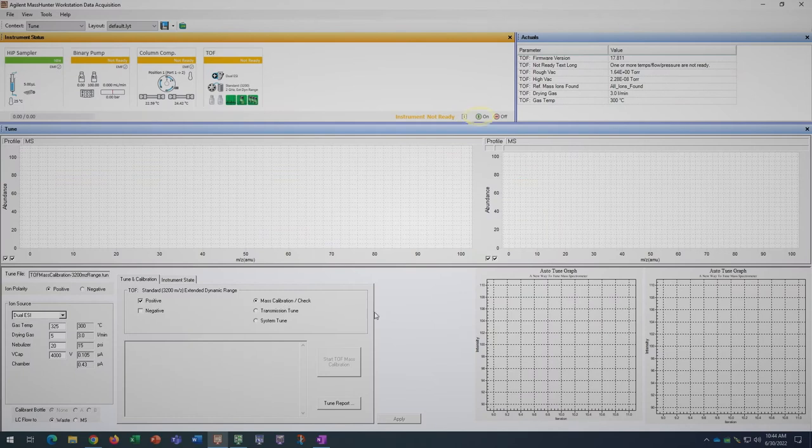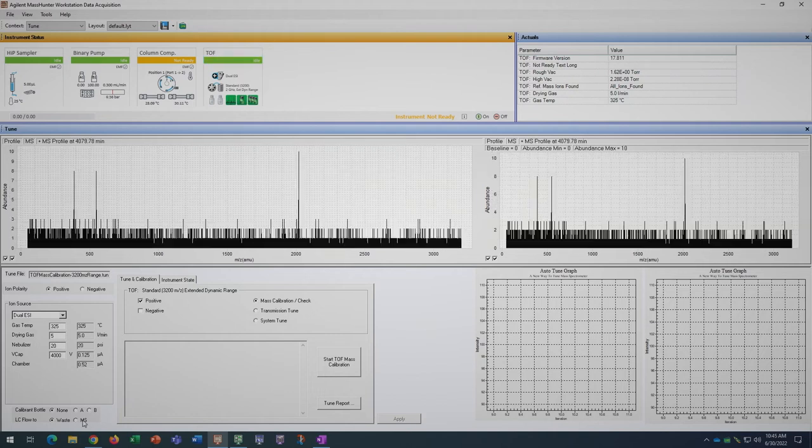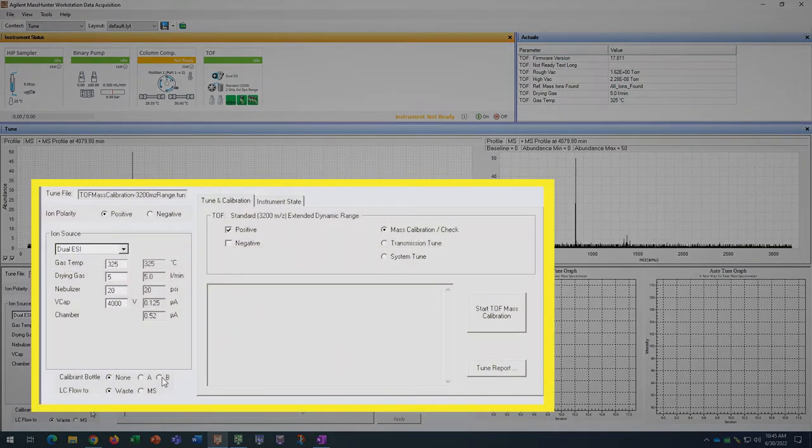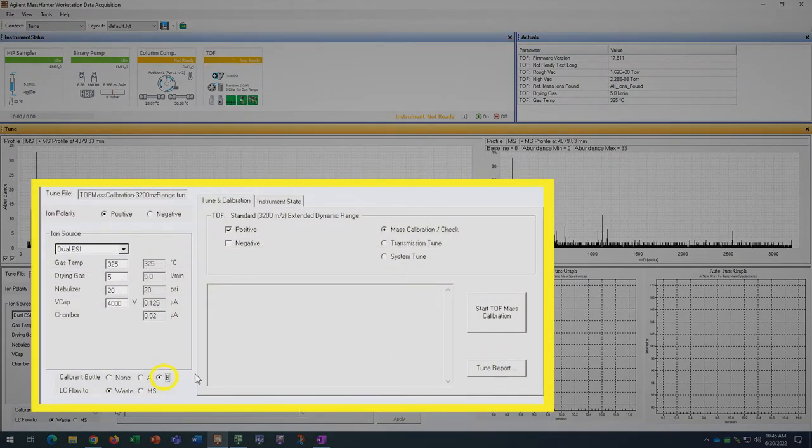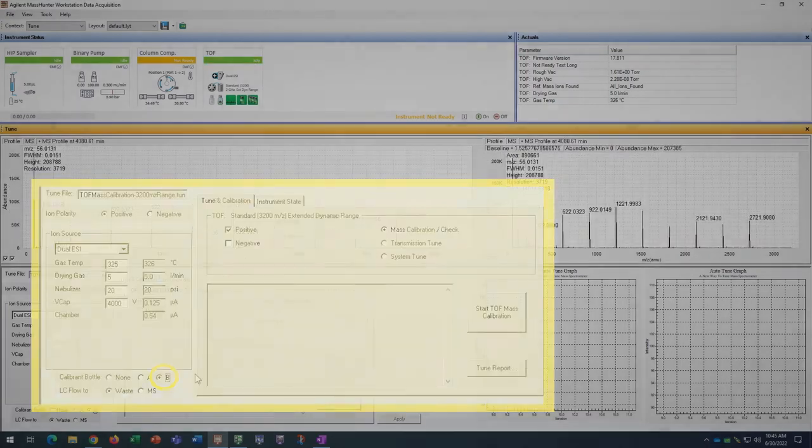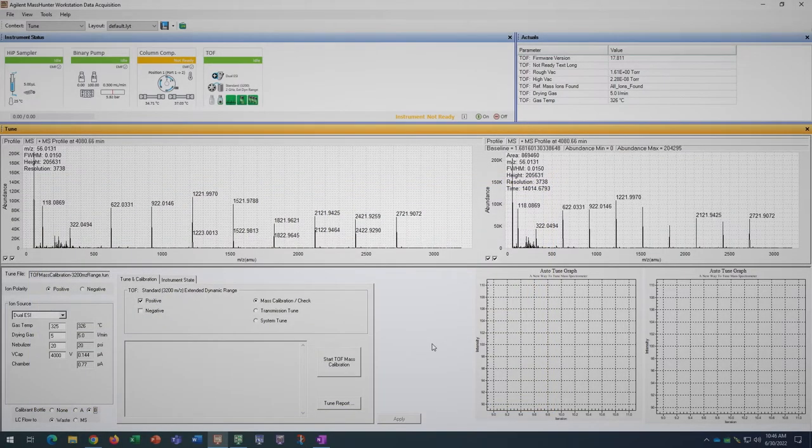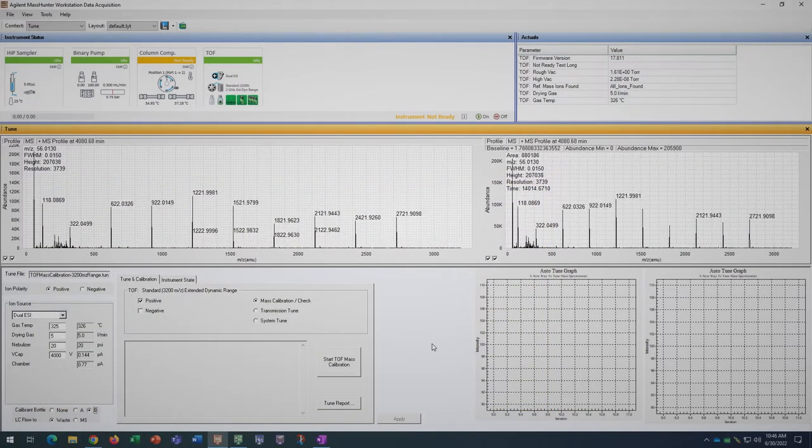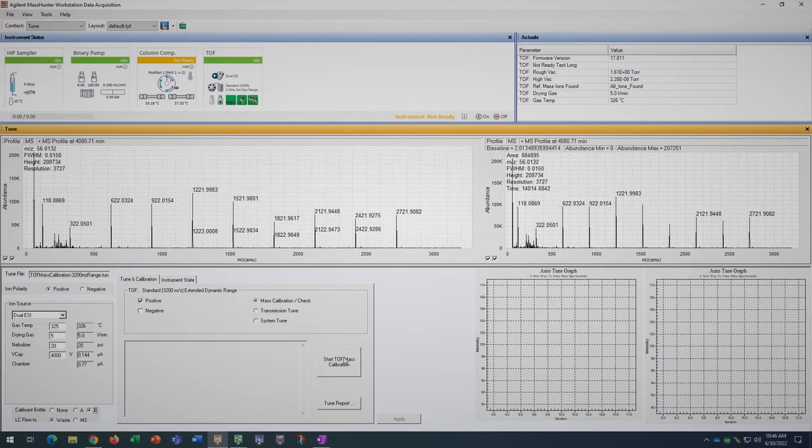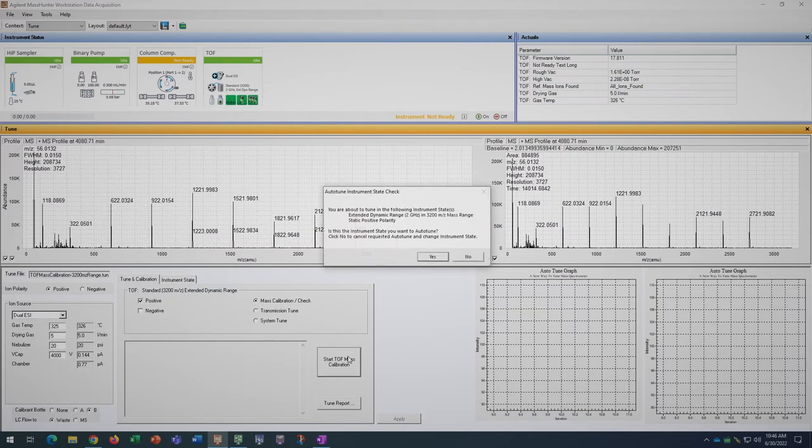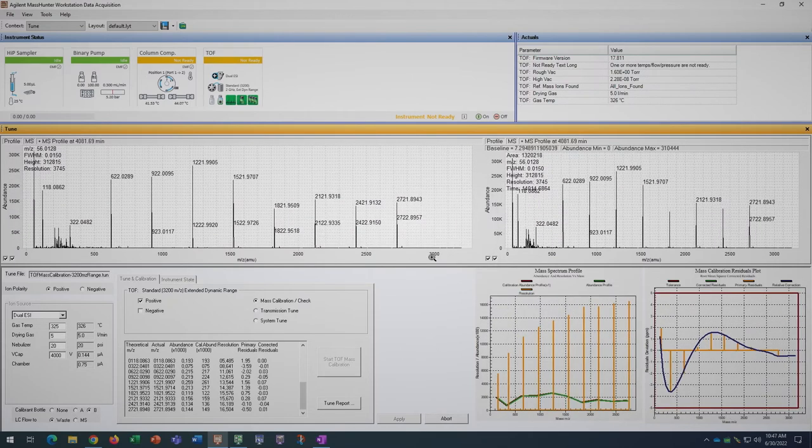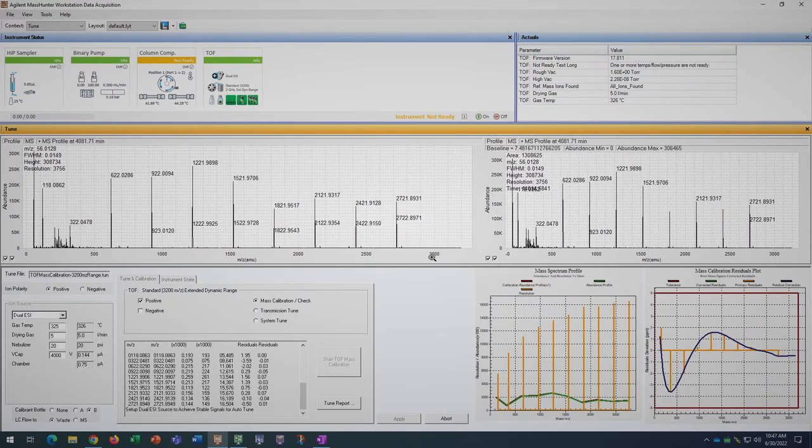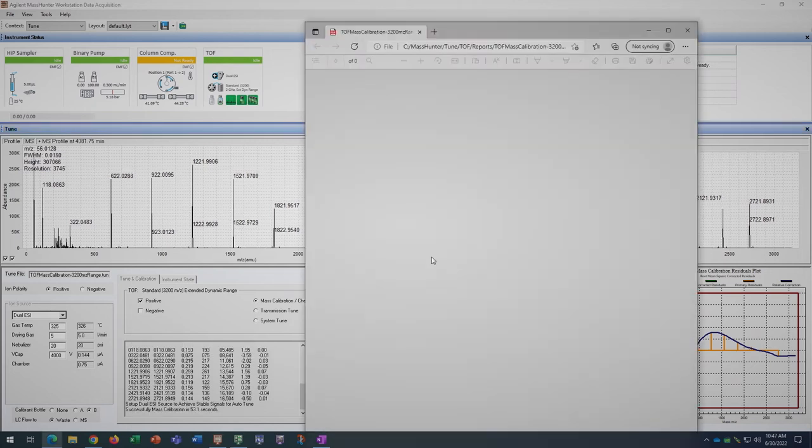Click the green on button above to start the instrument. Below the ion source area, select calibrant bottle B to flow tune mix into the TOF. Once you see all of the tune mix peaks appear on the MS profile, click start TOF mass calibration. If the auto tune completes successfully, it will bring up a PDF document of the tune report.